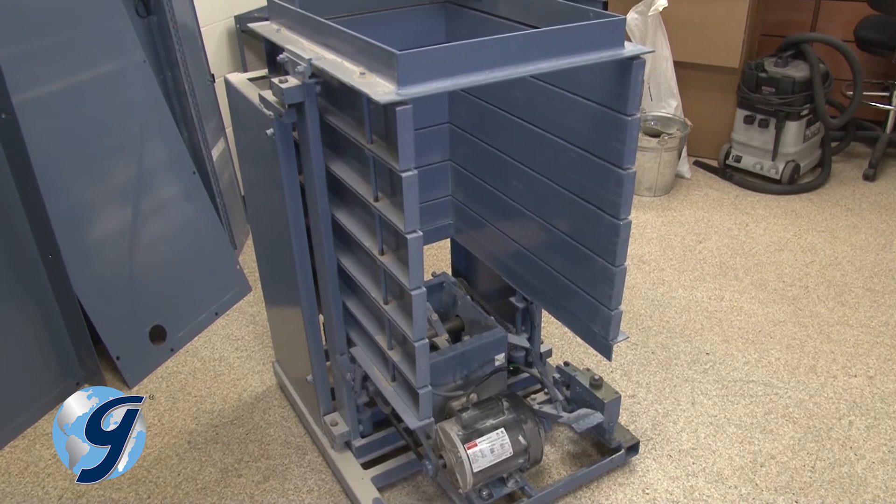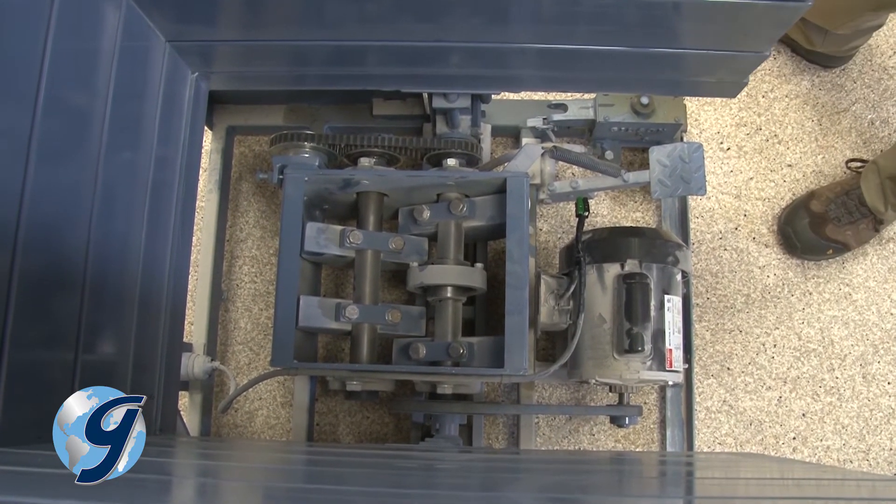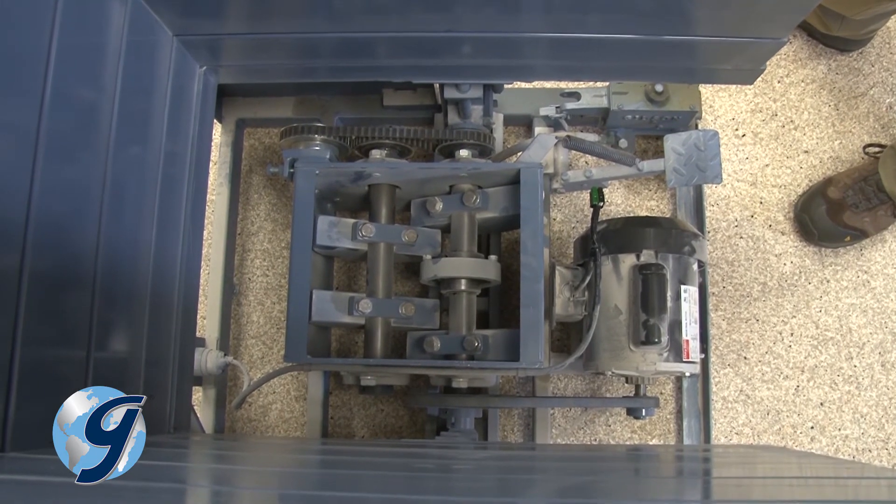Now you have complete access to the components of the Gilson Test Master for inspection, adjustment, or replacement as necessary.